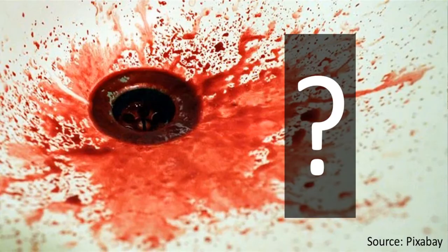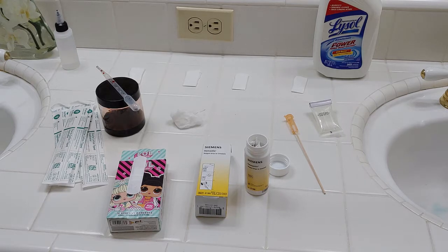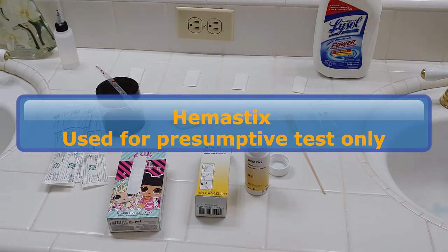What that is — say you see a bloodstain at a scene, you're pretty sure it's blood, you're going to do a presumptive test. Based on this presumptive test, you can get a preliminary result and say that you believe this is a bloodstain, not only based on investigator experience, but also based on presumptive blood testing. There is a chance of false positives with these, so remember, this is just a presumptive — something you're going to use at a scene to increase your confidence that something is blood.